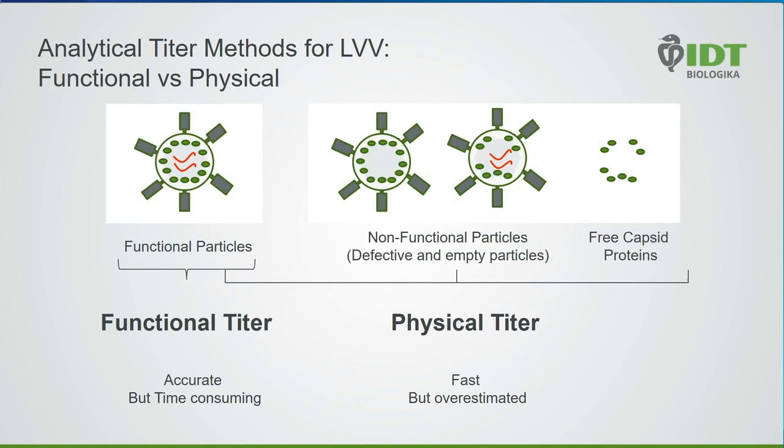In this section, I will discuss different analytical methods in order to determine the virus titer in the virus preparation. So what is virus titer? Titer is a measurement of virus concentration in the harvested virus preparation. And why is it needed? Because we need this information for the downstream infection process.